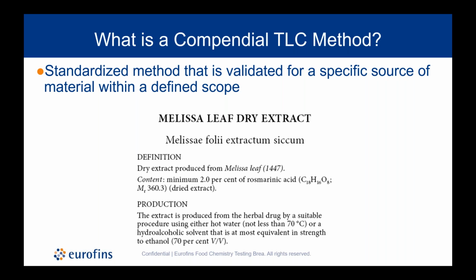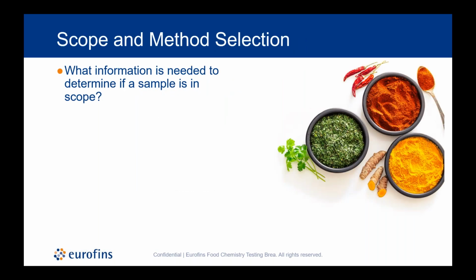Specifically here, you can see that hot water or hydroalcoholic solvent is used in the production of this type of extract. So to meet the scope for this pharmacopoeial method, your sample would need to fall under these parameters in order to ensure that the testing is fit for purpose.